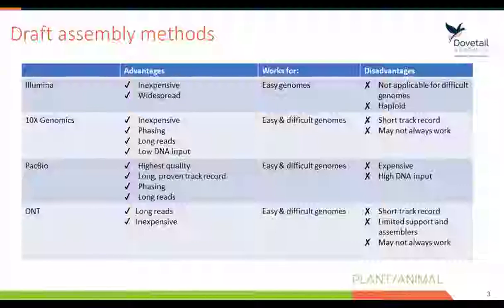If you're not working with one of those, then you really need to bring in some kind of long-read technology, which could be 10x Genomics, PacBio, Oxford Nanopore are the most common ones. And I've listed the advantages and disadvantages of each of those. And again, if we're building this assembly at Dovetail, we'll make sure we consult with you on choosing the best approach for your budget and for the level of complexity of the assembly that you have.